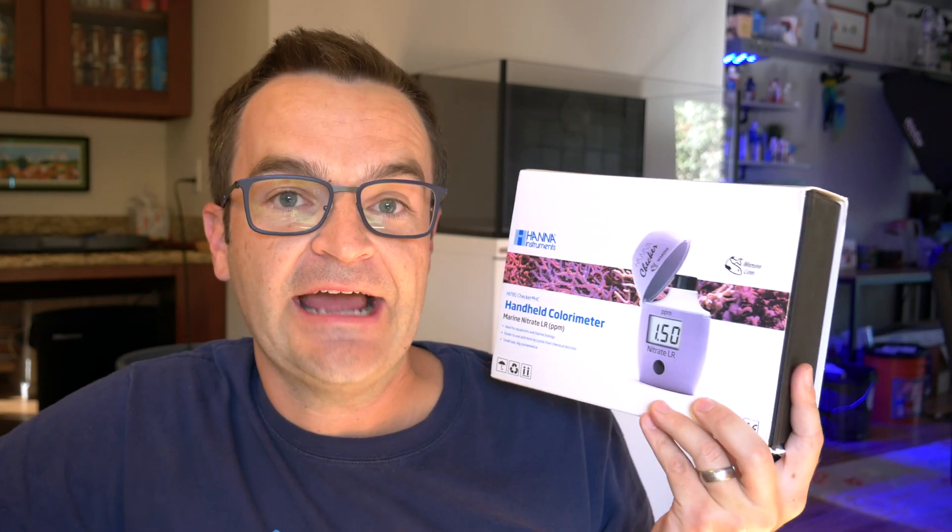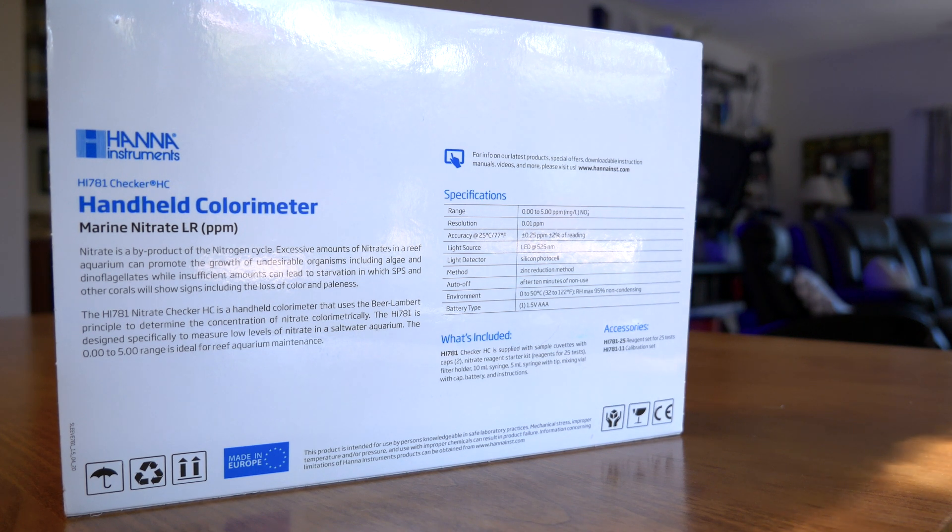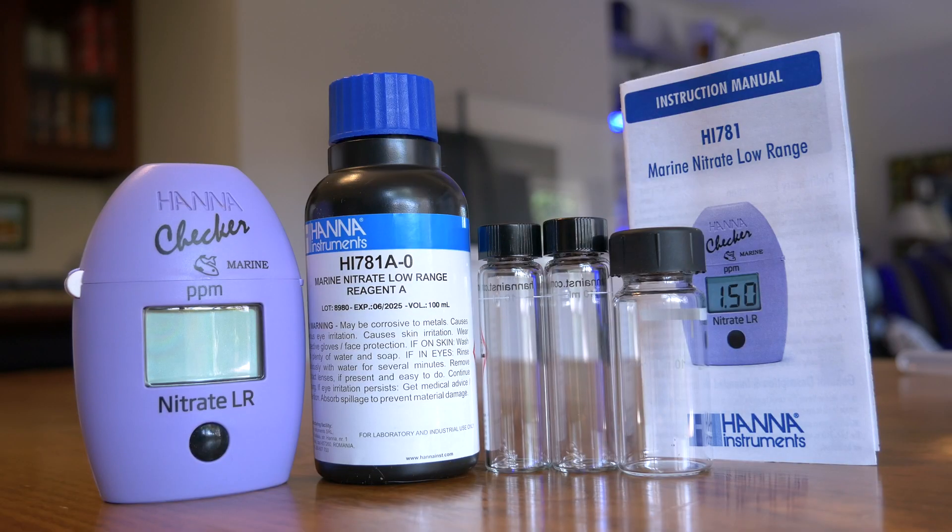I'm not going to use this test. I have four tanks and I'm not willing to spend over an hour every weekend on this. This is probably the most accurate test kit on the market, but for the everyday hobbyist, you are not going to need to spend $50 when you can buy an API, Red Sea, or Salifert test kit for a lot cheaper and get results much quicker. Who is going to want to purchase this? I think you'll want it if you have an SPS-dominant tank or some other tank where really precise nitrate readings are crucial. Or if you're a Hanna checker fanatic who wants every checker available, or if you only have one or two tanks and absolutely love spending time testing.